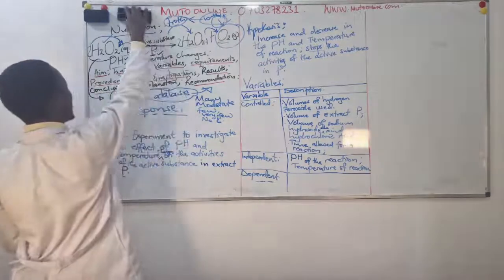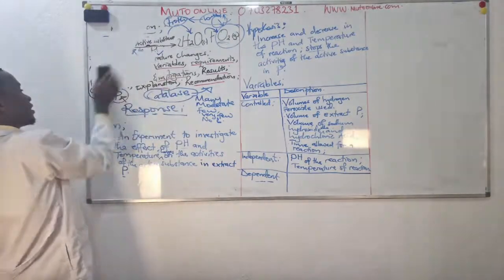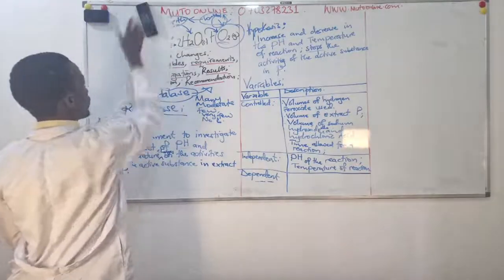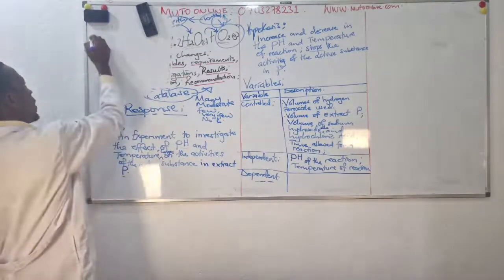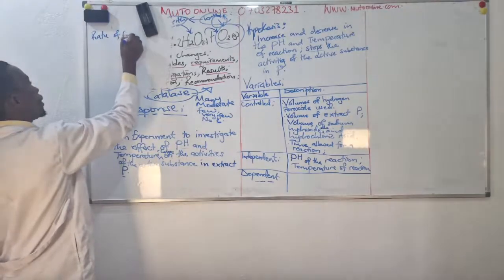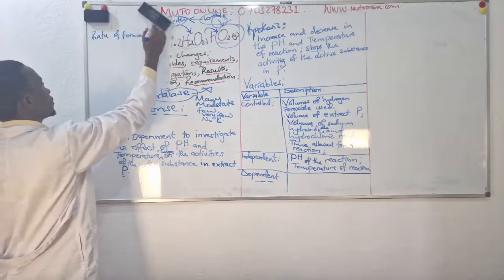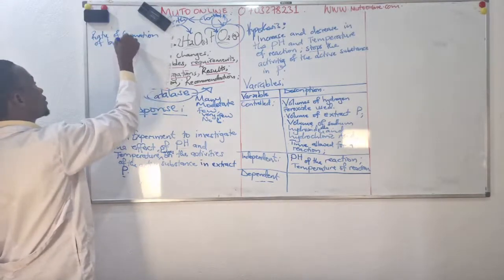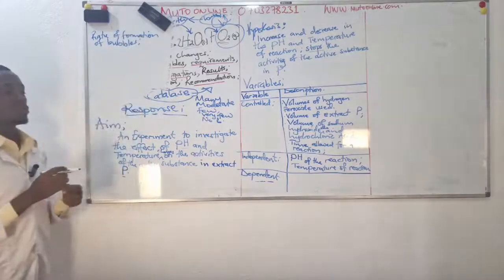As well, we may talk about the rate of formation of bubbles as our observation.